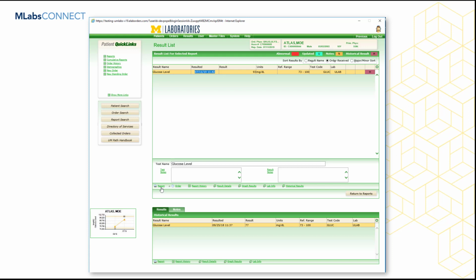If you are only interested in viewing the report, use the cursor to hover next to the report icon, and an upward directional arrow will appear. Select the arrow. A menu will appear with different options. From here, View Only can be selected.